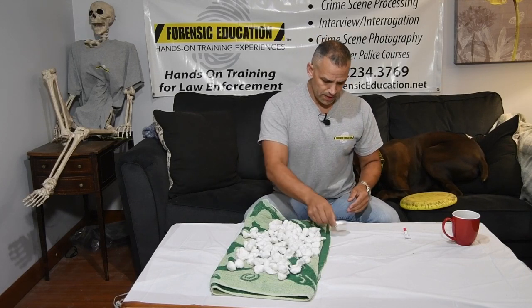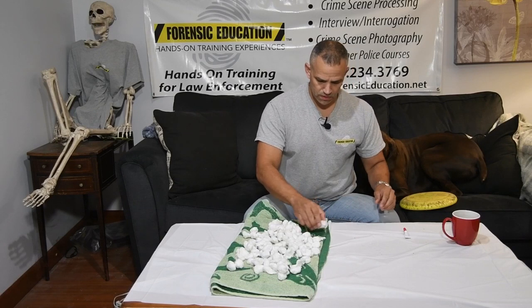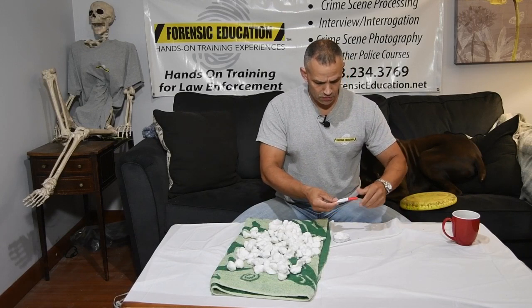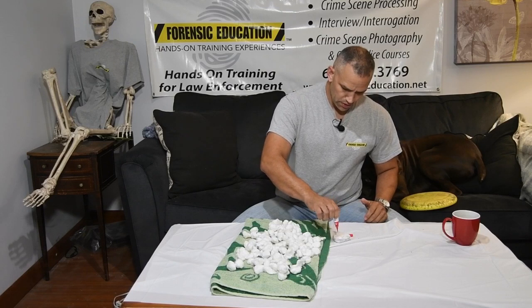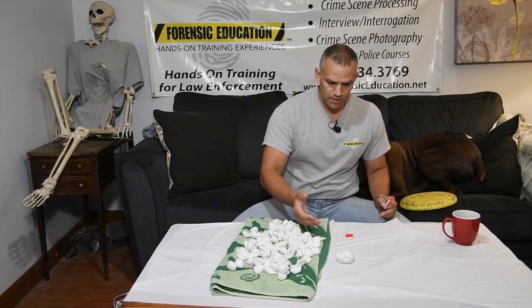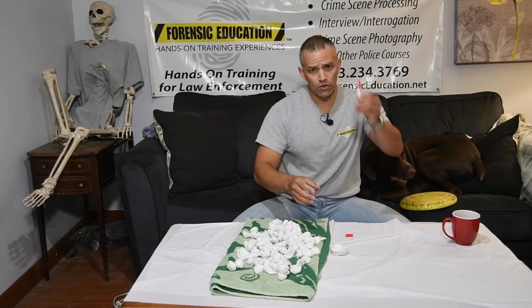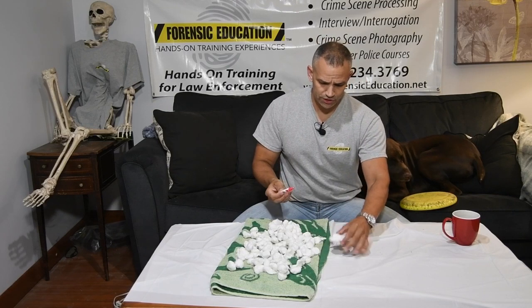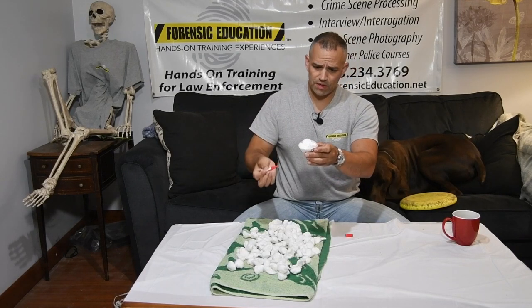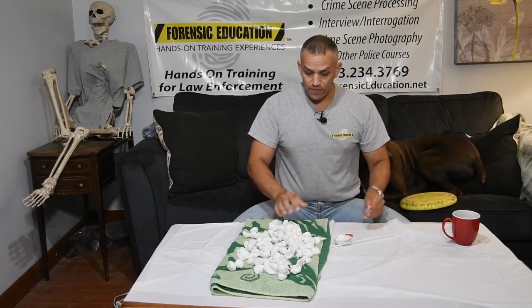To use them, I would put a couple in a little tray like this. Then take your superglue and put that on them — this would be underneath your hood or your fuming chamber. You can really see that fuming happening. You're going to load a full amount of superglue on here; I didn't have much left in this one but you can still see just the little bits fuming.